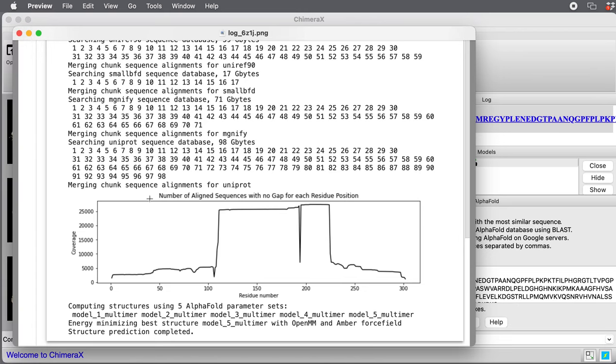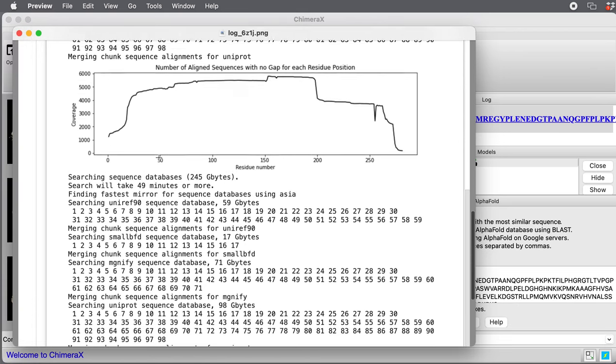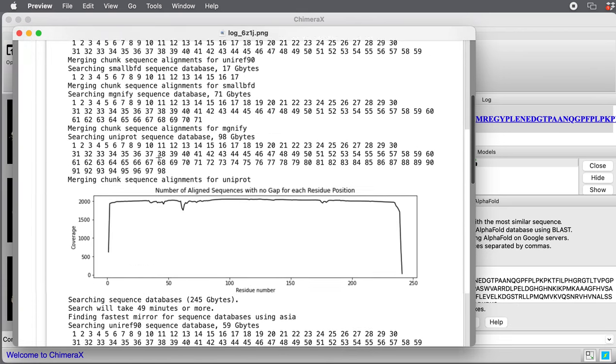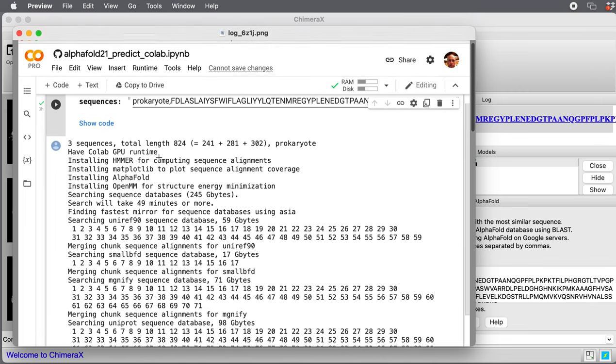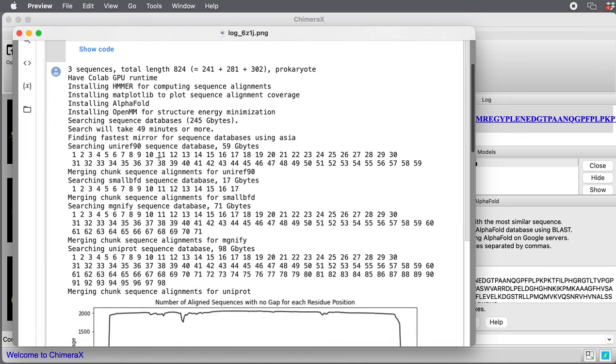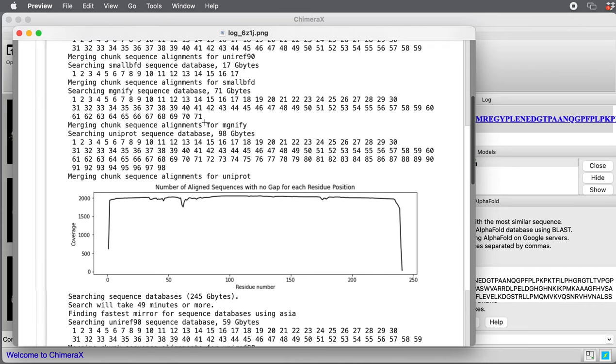This is a screenshot of the log after it's run for the five hours. You'll see all these numbers here. It's searching 245 gigabytes of sequence databases to find multiple sequence alignments for each of the three proteins.